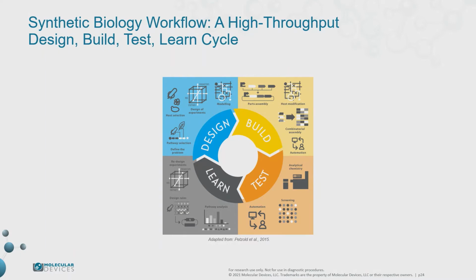Historically, such cycles have been performed manually with limited formal problem definition and progress tracking. Researchers have devoted substantial effort to define and automate many sub-problems of these cycles to create workflows that include data management and tracking as part of the automation package.